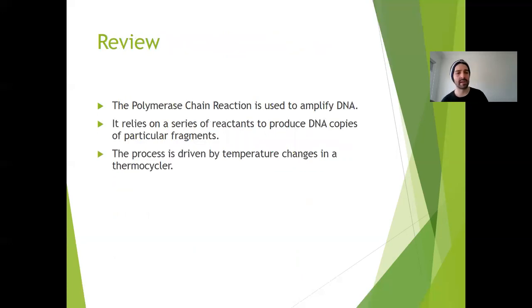So in review, PCR, or the polymerase chain reaction, is just a process that we use to amplify DNA, and it relies on a series of reactants to produce DNA of particular fragments. And obviously it's driven by temperature, and we use a thermocycler to help this process occur.